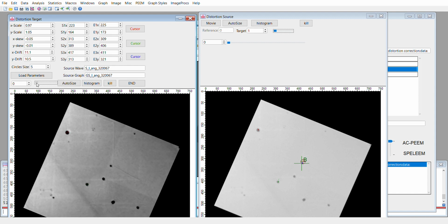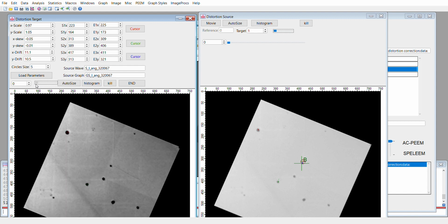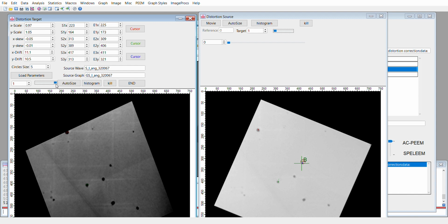So what we need to do is to see how it moves, and then drag this slider on the right and tweak the X and Y position of the point 2 of the start in order to improve.